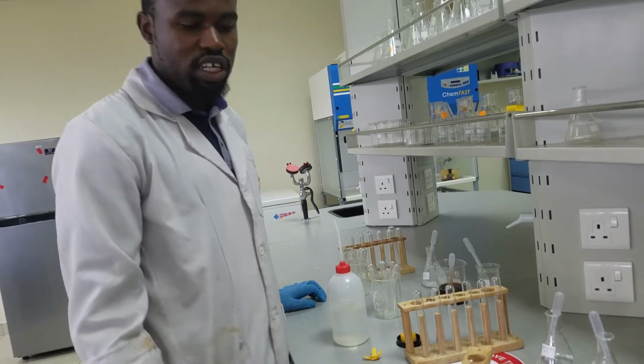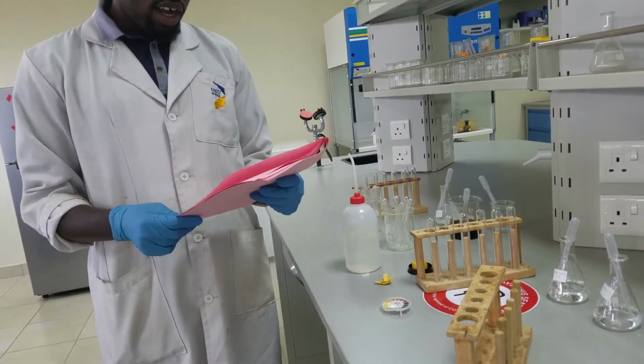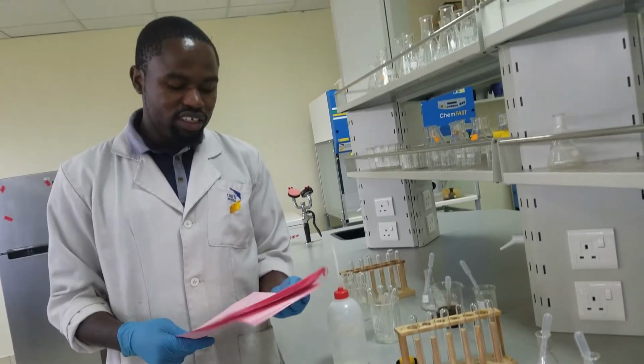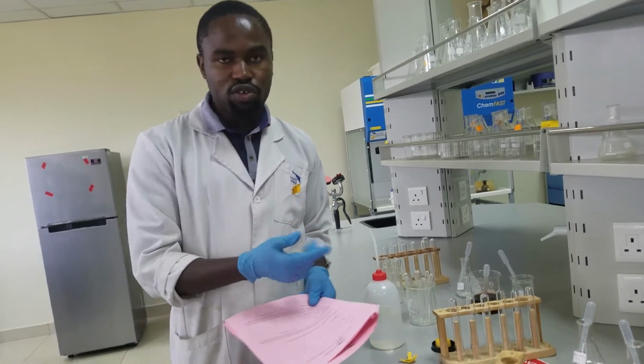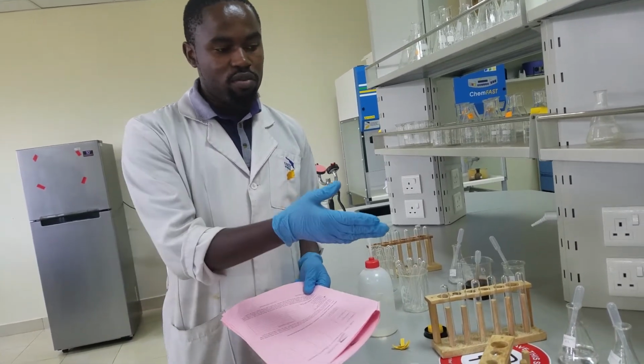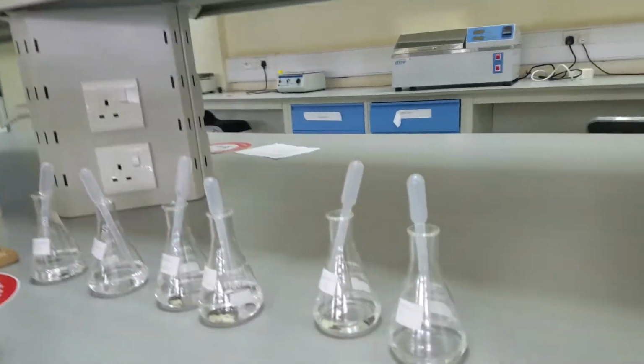Now I'm going to take you through the second part of this practical, where we are going to identify aldehydes, ketones, and carboxylic acids that we are going to use today. And then we have our two unknowns, which is part of this.